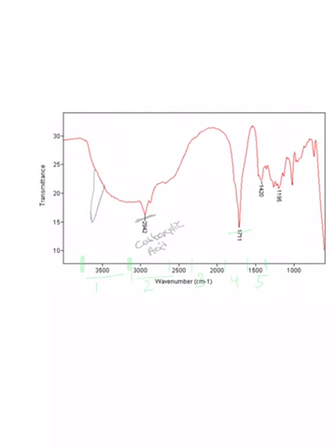So a carboxylic acid is a possibility here. In zone 3, we notice that we don't have any peaks, so we're not going to have anything there. In zone 4, we do notice that we have a peak here, and this could very well mean that we have a carbon double bonded to an O. And in zone 5, we see that we don't have any peaks, meaning we won't have functional groups such as alkenes. We also didn't have any peaks in the third region, so we're not going to have any carbons triple bonded to another carbon or nitrogen or anything of that nature.